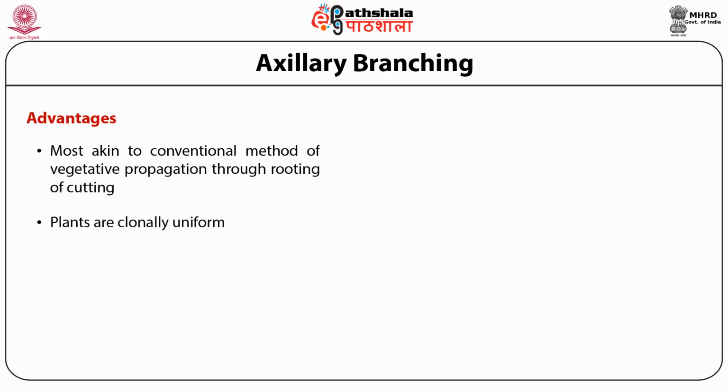We give growth regulators that favor shoot growth, which shows bud break, and you maintain the right concentration of inorganic and organic salts so that the shoot keeps on growing. This way you can get a large number of shoots which can then be put for rooting purposes.